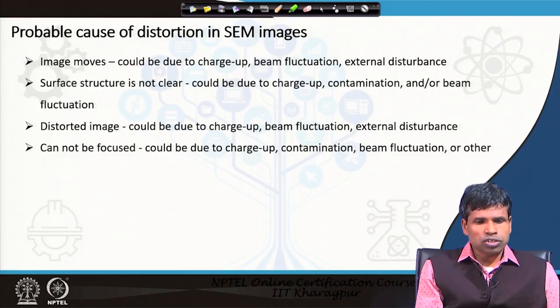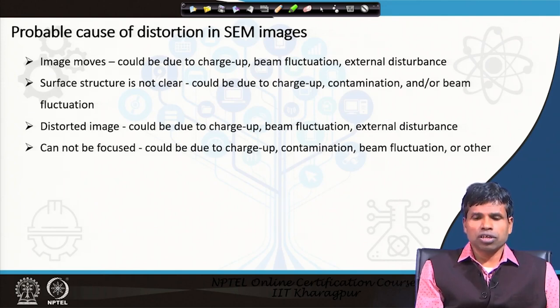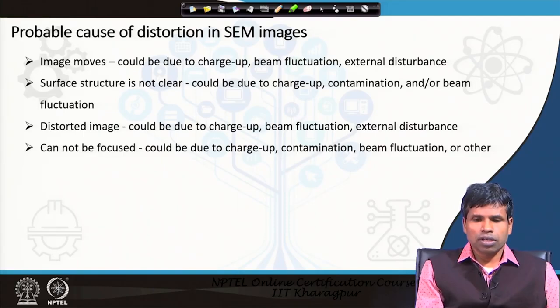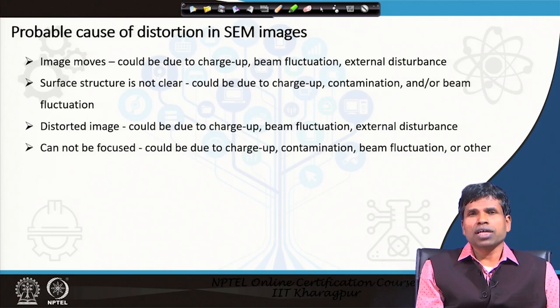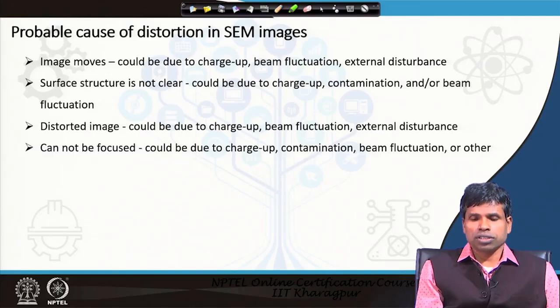The second probable cause of distortion is that the surface structure is not clear. Surface structure will certainly not be clear if the sample is insulating, because charge build-up on the surface prevents us from getting the necessary signal. This can also happen due to contamination or beam fluctuation. Third is a distorted image due to charge-up, beam fluctuation, and external disturbances. Fourth, if you are unable to focus — this could be because charging up prevents us from seeing the actual surface, or due to contamination and beam fluctuation.